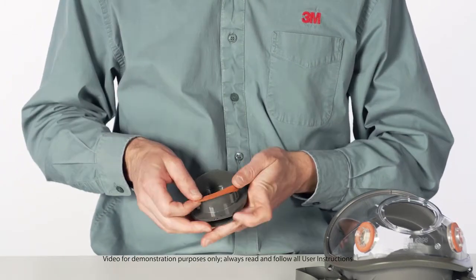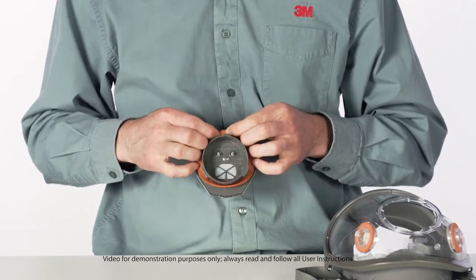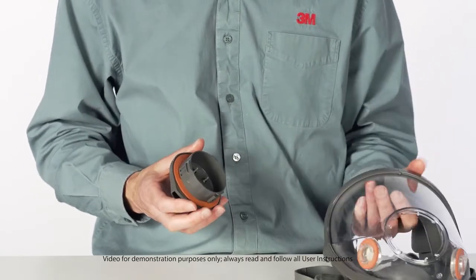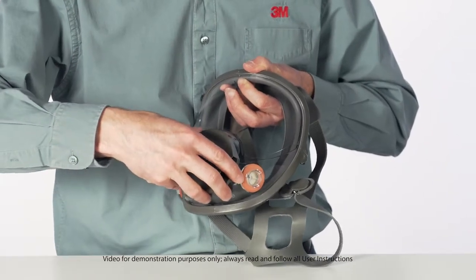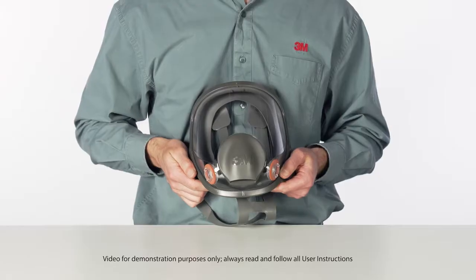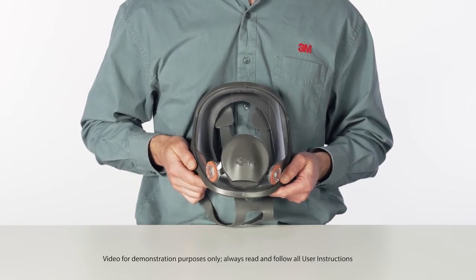Install the new center adapter gasket. Align the tabs on the center adapter base with the notches in the center port of the facepiece lens. Slide the adapter into the lens port and twist it clockwise one-quarter turn to stop. Be certain that the center adapter gasket is properly in place and sealed and that the adapter assembly is fully engaged.